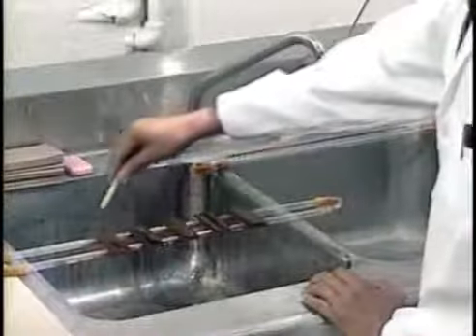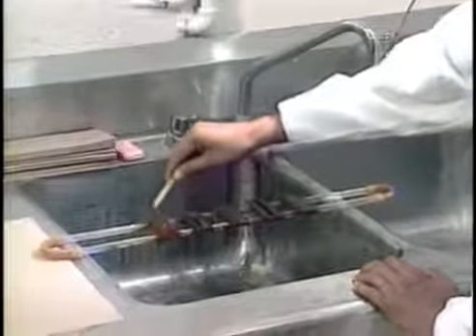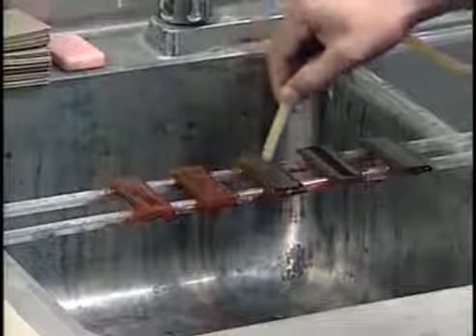Gently wash the stain from each slide with a stream of cold water until all free stain has washed away. Always rinse gently so the smear is not washed off of the slide. Individually tilt each slide to drain off any excess rinse water. This prevents puddles remaining on the slide which can dilute the next reagent.